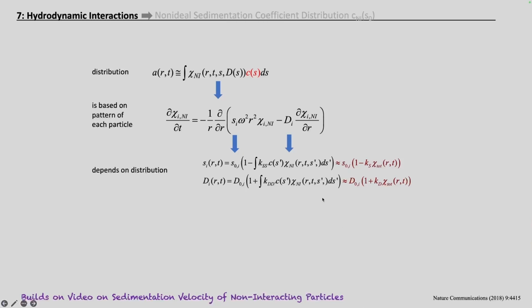If ks is the same, then we can pull it out of the integral and we are left with the integral over the entire distribution, which by definition is just the local total concentration. Second, we recognize that the sedimentation data themselves, if recorded with the interference optical system, will give us directly an experimental estimate of that total concentration and its evolution in time, since conveniently the refractive index increments of different protein species are usually very similar.